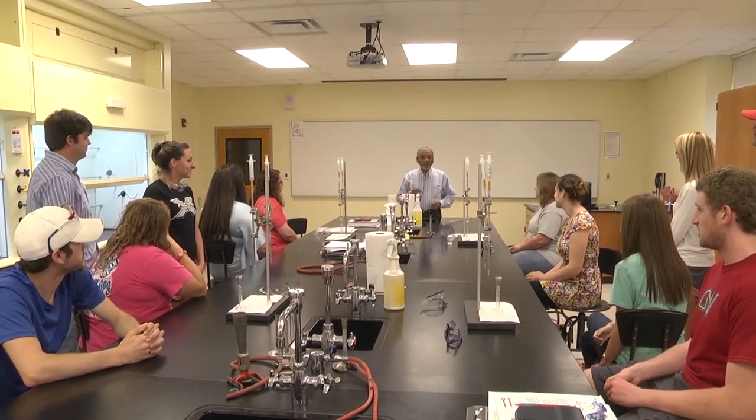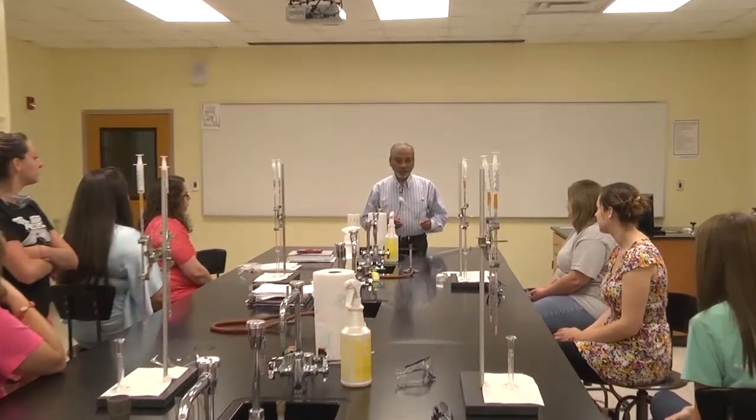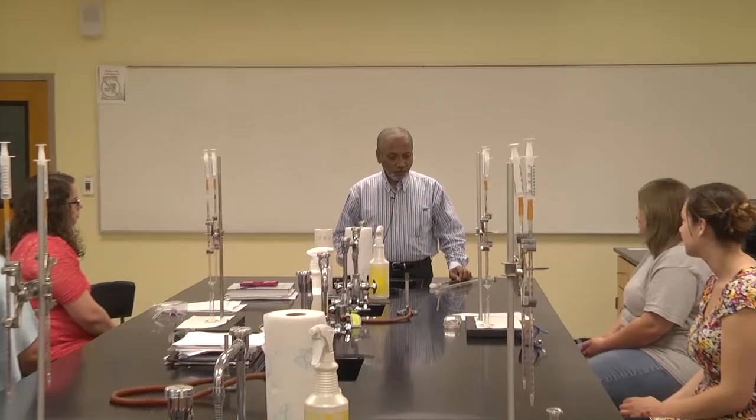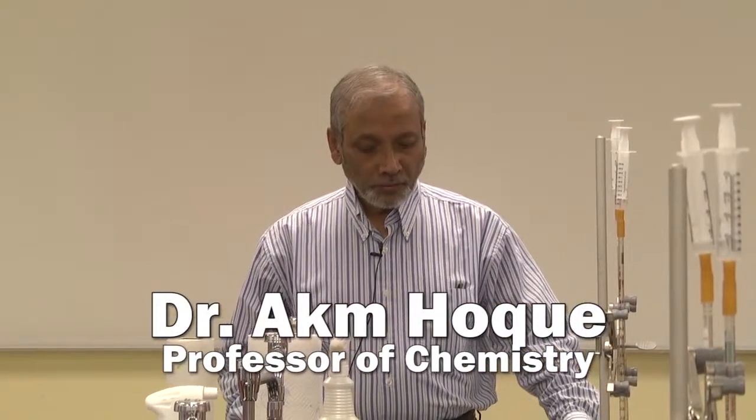All right. Today you are going to do an experiment by using microscale technique. You will be doing a microscale acid-base titration. In a normal titration, we use this burette, which is 50 milliliter. But in microscale titration, we will be using this burette. It's called microburette, and it's only 2 milliliter, right?